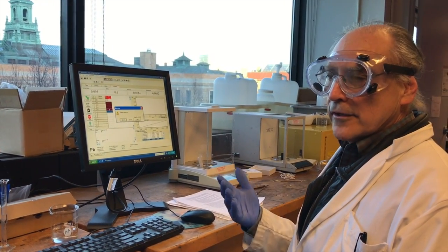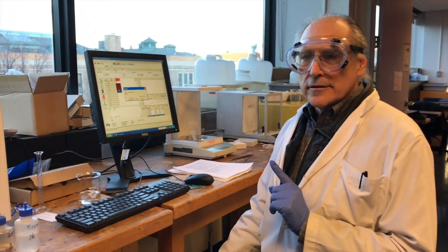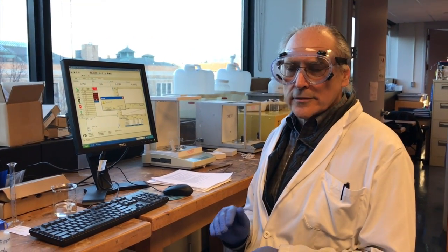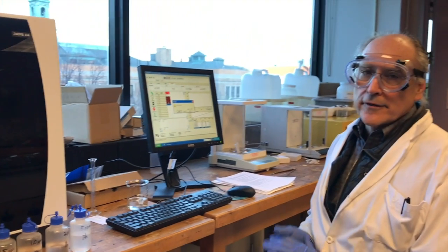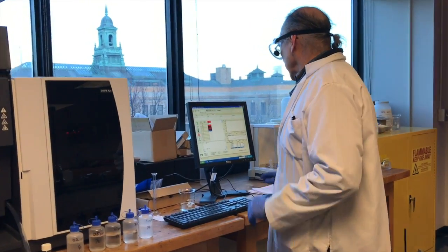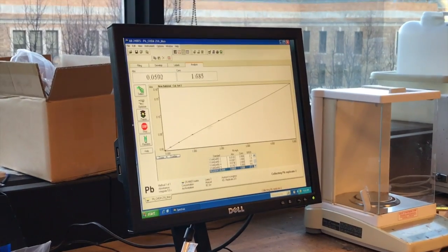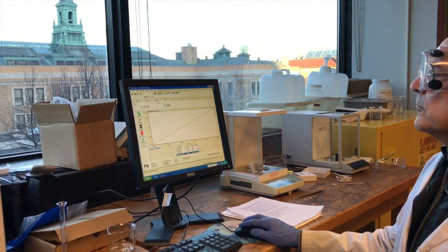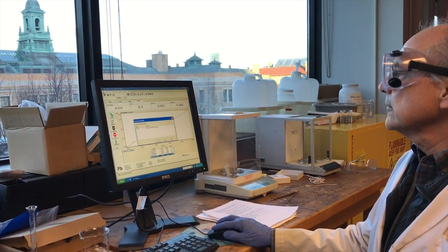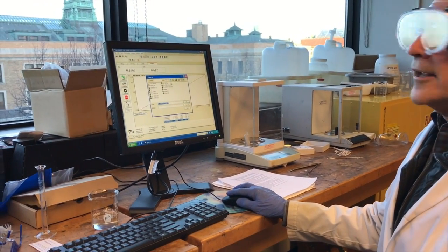The instrument is set up to turn off the flame when you've taken all of the samples. There's one exercise you'll do as a class — determine the detection limit. You'll have a sample that's quite low and the AA water which is the blank, and you'll be alternating back and forth, recording that data using a template. Take a look at this calibration chart — it's really quite good over the scale, so that's going to give us excellent results. Remember to save your data — go to File, Save As, and give it a name under the appropriate folder.